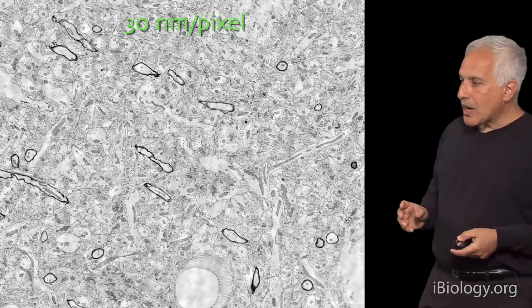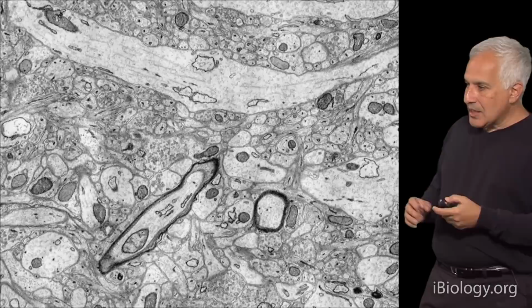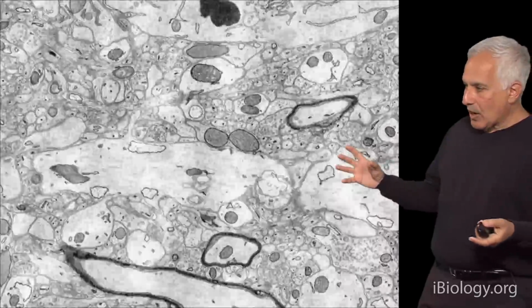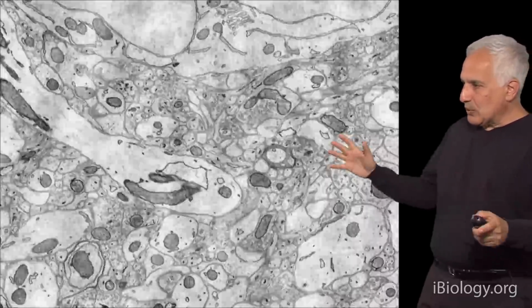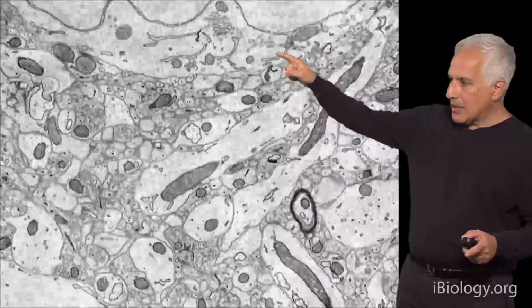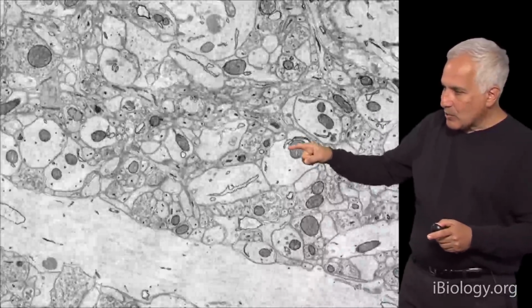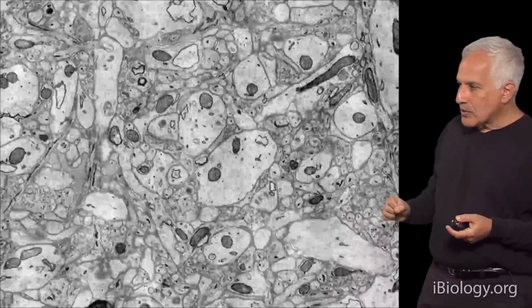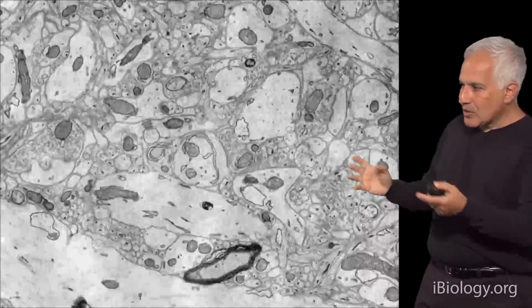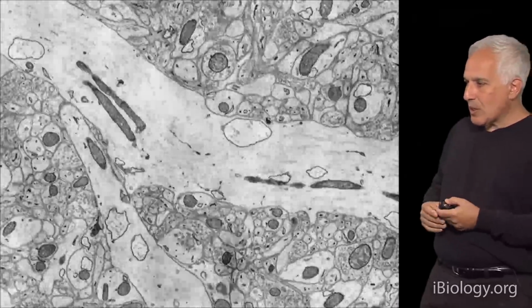If we zoom up at higher resolution and look at the same data, you see that between these large objects moving around are lots of little wires also moving around. The brain is just filled with wires. This is a big cell body of a neuron up here, a pyramidal cell, and all these little wires are moving from one place to another, filled with vesicles. Those vesicles are where the synapses are. If you look carefully, you'll see that there are synaptic vesicle-filled profiles almost everywhere in the gray matter.